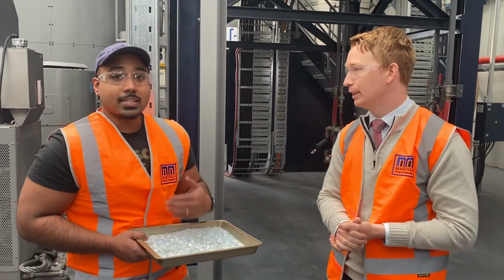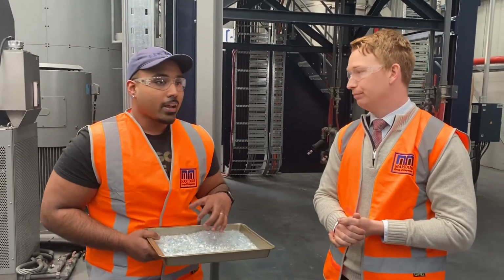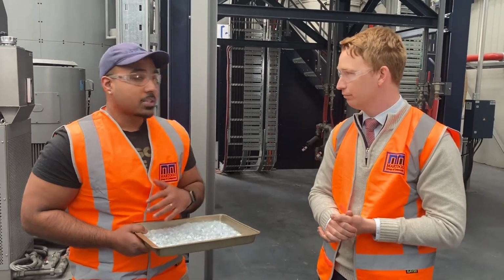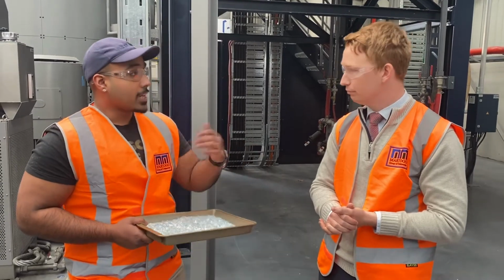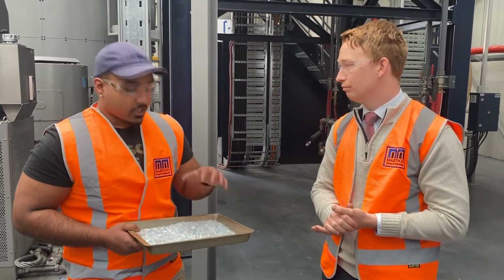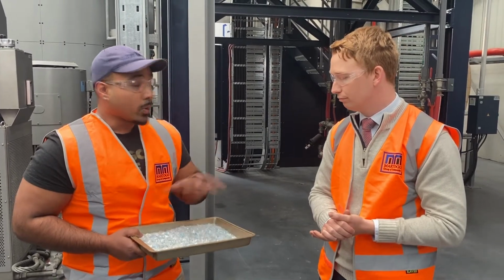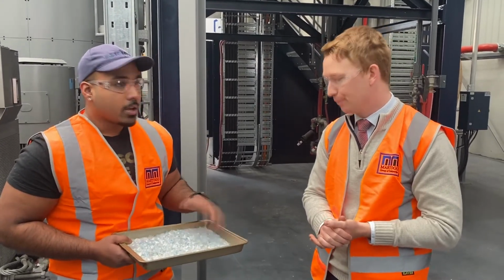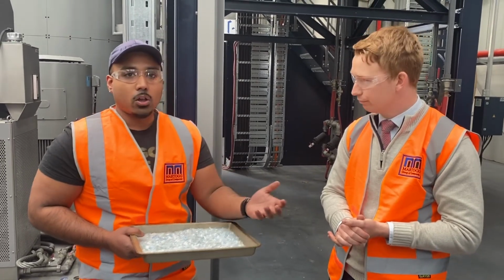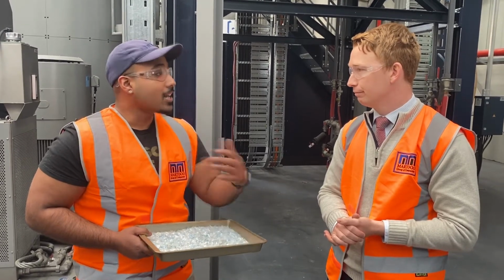Yep. You know, we want to see this before it goes in. That's why we make it an objective to do random audits on the raw materials that come in. Every raw material that's approved and that we get in, we do tests on them before we give them the okay. So it's very important that we are all on top of this. Yep. Because any slight contamination affects our color, affects our quality, affects our integrity. Yep. So we want to maintain the highest quality possible.